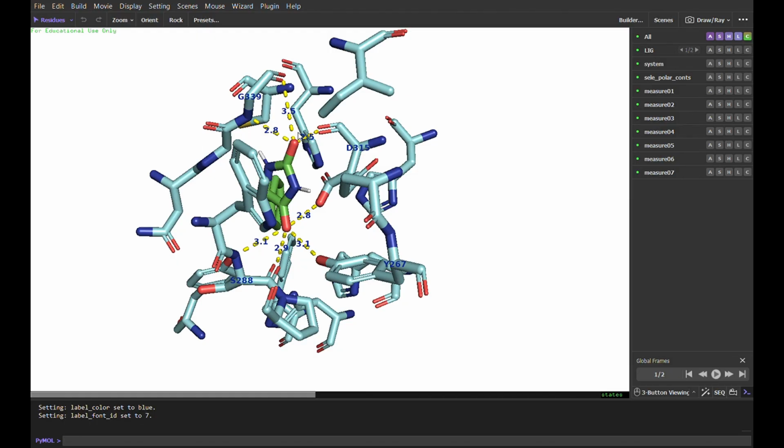And afterwards I plan to change the viewing to edit, so as to move the labels to a better place for clarity. So this is tyrosine 267. What I do, I press Ctrl and right click, and then I move, but try not to press anywhere, just on that label, otherwise you can change the structures of the amino acids.